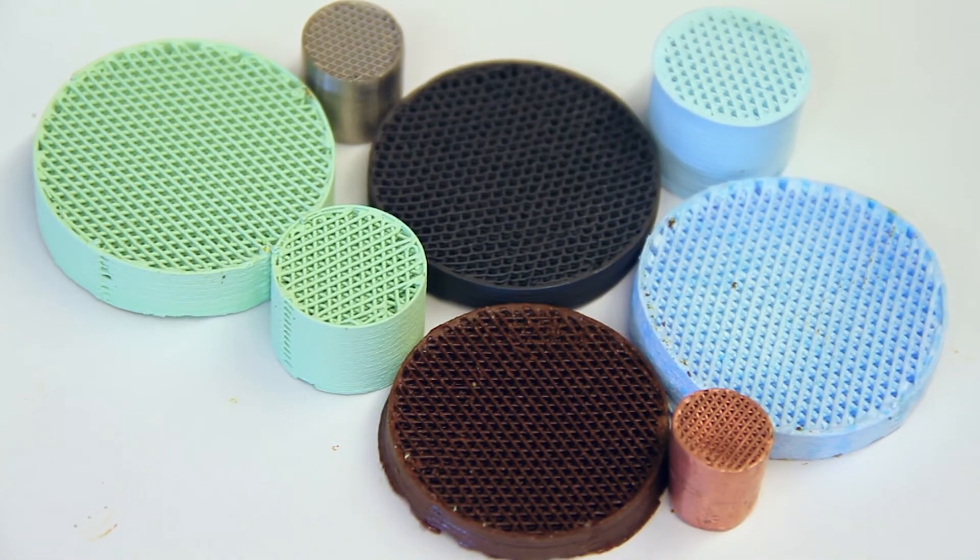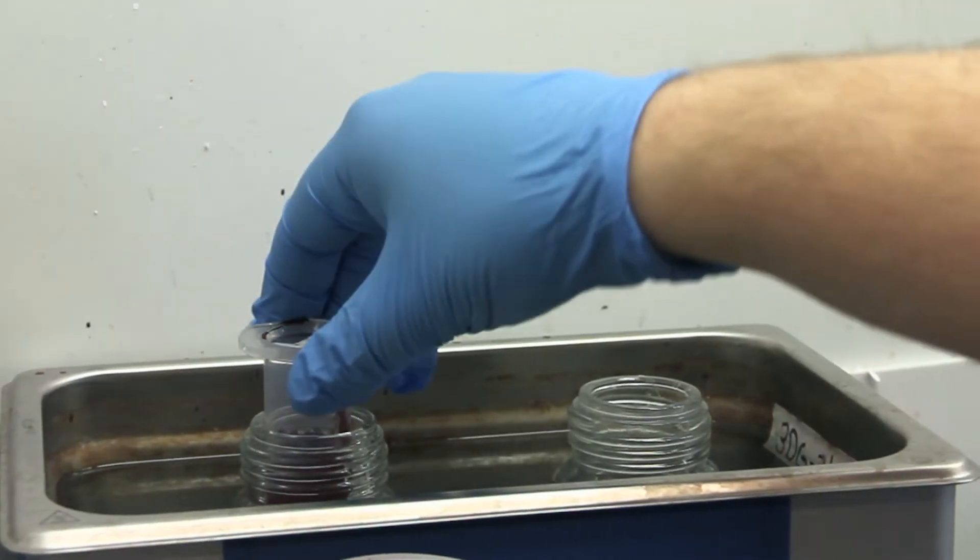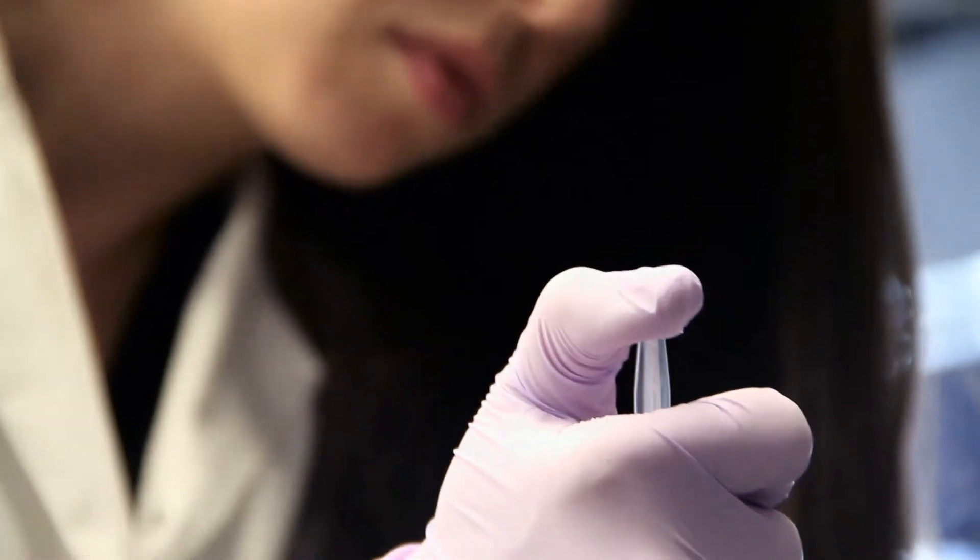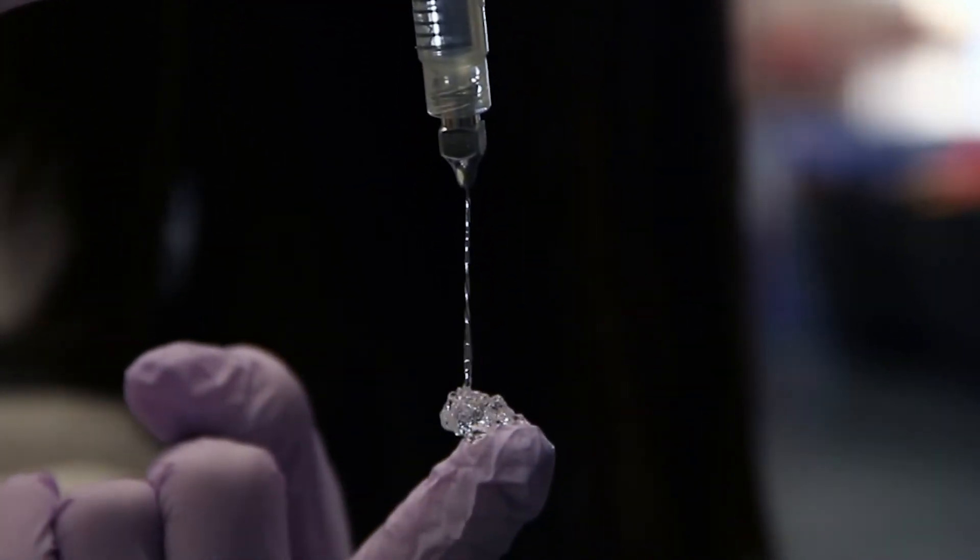This really increases the 3D printable materials palette where you can swap out one cartridge to print metals and alloys, or swap out another to print material that regenerates nerve tissue or muscle tissue.